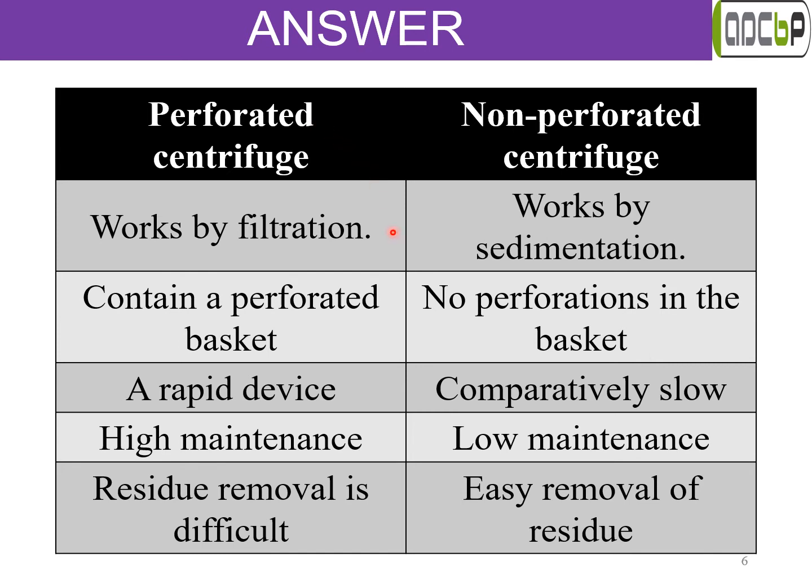Now, here are the key differences between perforated and non-perforated centrifuges. The perforated centrifuge works by filtration principle, whereas non-perforated centrifuges work by sedimentation. Perforated centrifuges contain a perforated basket, whereas there are no perforations in the basket present in a non-perforated centrifuge.